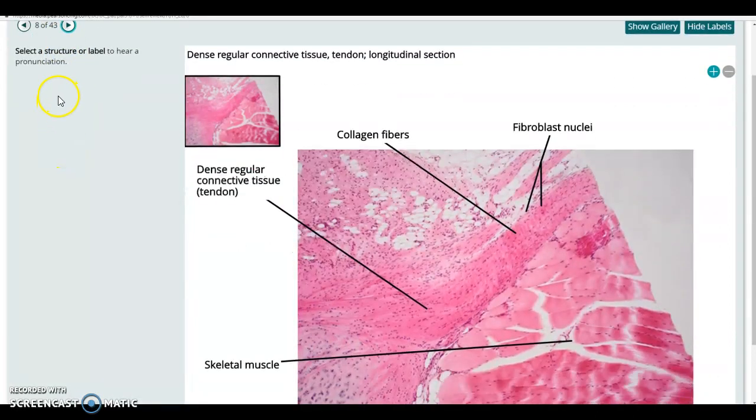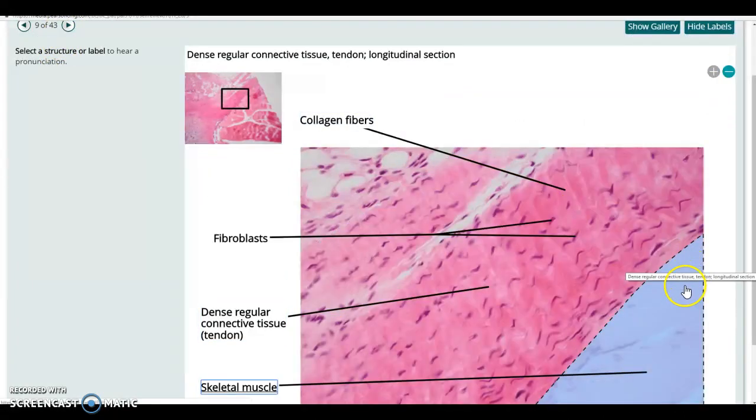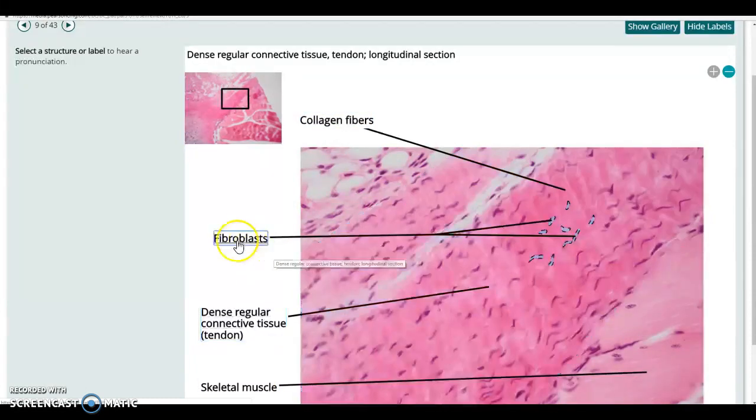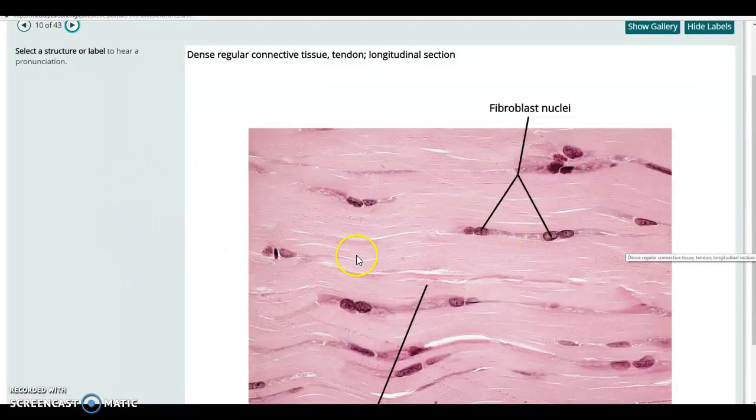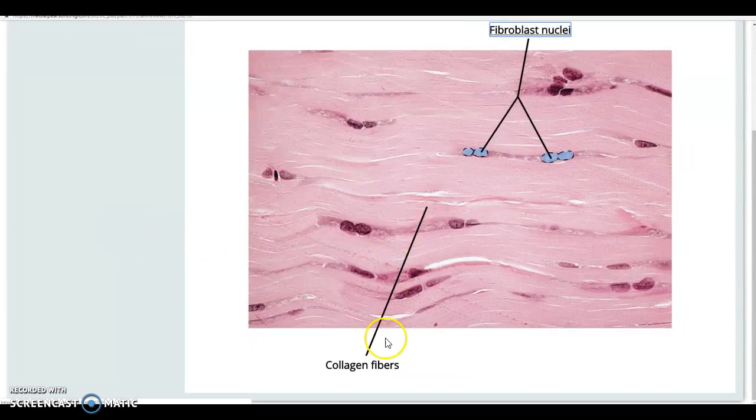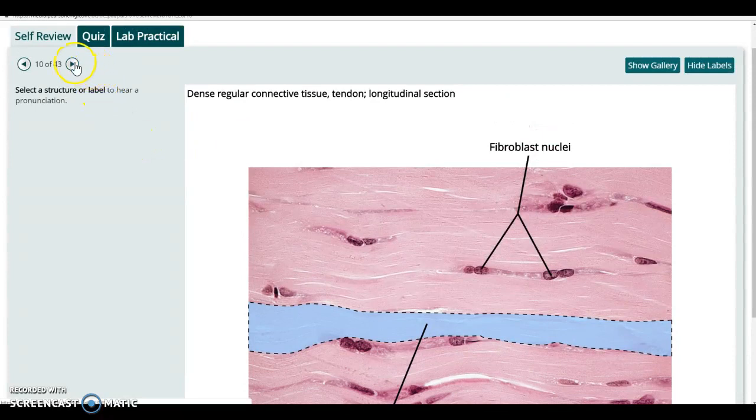Dense regular connective tissue. This is a so-so slide, but you can see the nice dense collagen fibers all lined up along here, and you can see all of the fibroblasts through there that produce the collagen fibers. And here's an even nicer view. Look at those fibers lined up along there with the fibroblasts interspersed throughout there. The whole thing is really filled up with collagen fibers in that regular dense connective tissue.